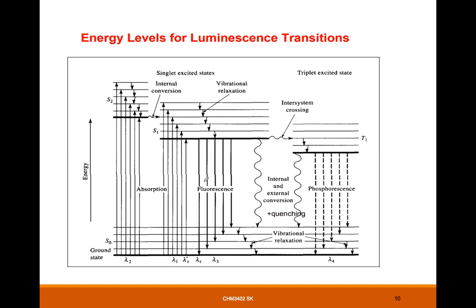So you can see that before the electron is released to the ground, it of course requires energy to be excited. So this is the absorption of energy.